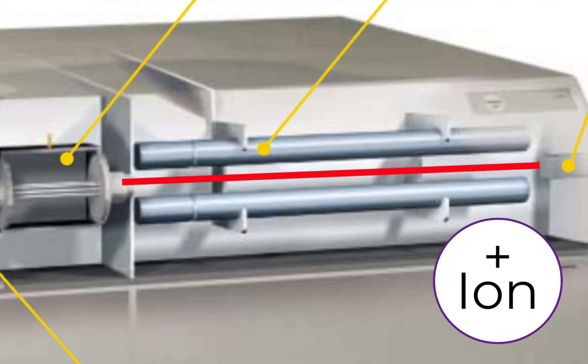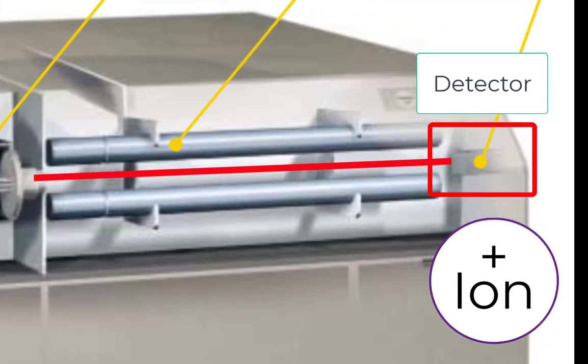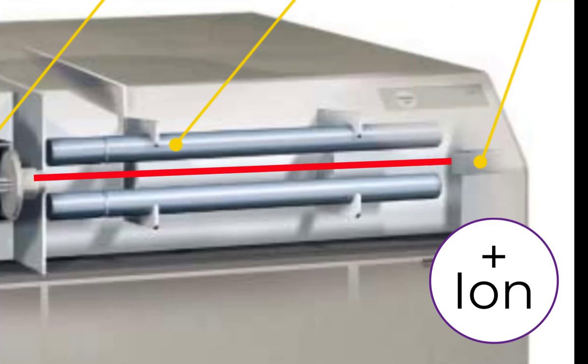So if, for example, you wanted to measure mass 56 for iron, then it would set to its preset voltage for iron 56, and then everything but 56 gets ejected into the vacuum, and only 56 will make it to the detector. And so we scan through all the masses that we're interested in and count each one individually.